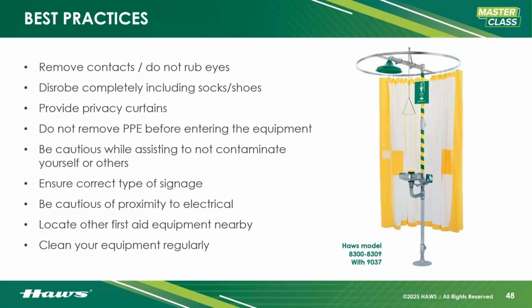Disrobe completely. You've got to be in your birthday suit. That includes socks, shoes. It is not time to be shy in front of your coworkers. This is a very serious emergency, and you've got to get it off because it will trap contaminants against your body. With that in mind, provide privacy curtains.